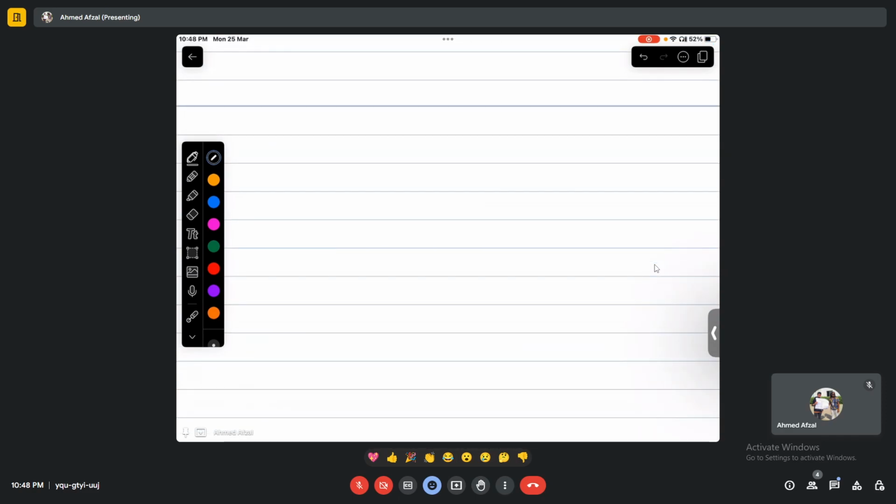So in this video, we are going to talk about different types of tests that are performed to identify carbohydrates. The first test in this series is a very fundamental test of whether an unknown solution contains carbohydrates to begin with or not.